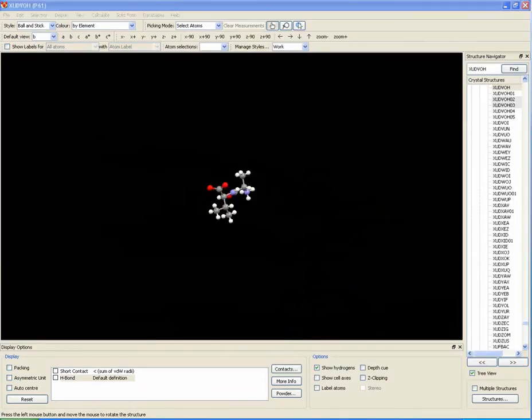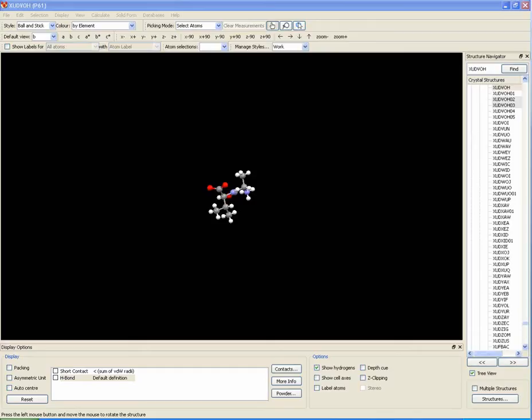This particular example is the crystal structure of a dipeptide compound. This example forms channels because of its interesting hydrogen bonding.